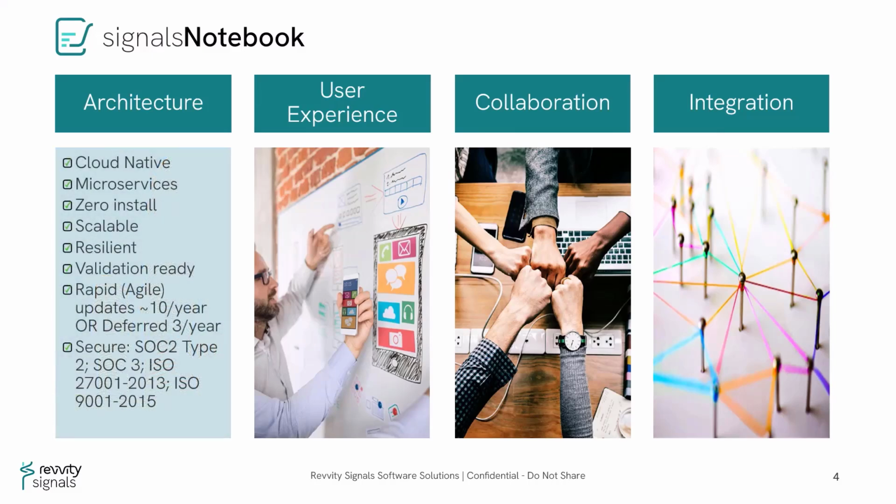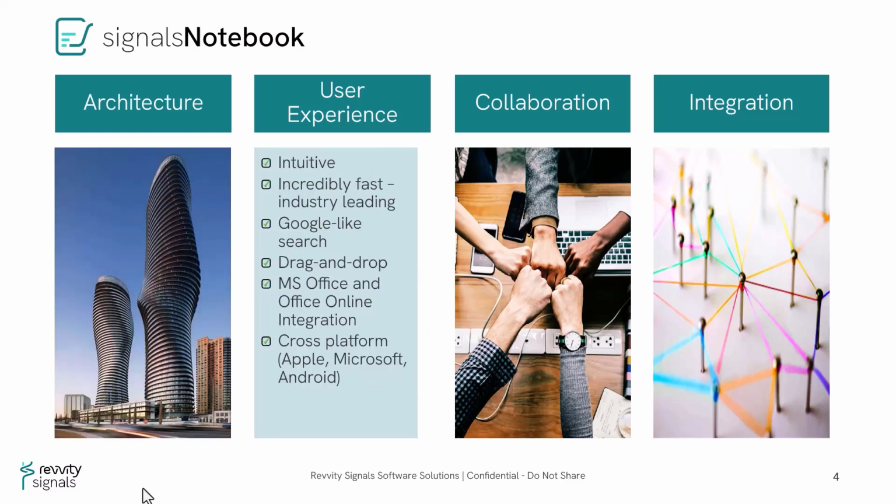Signals is a 100% cloud-based collaborative platform designed using the best available technologies so that your Signals Notebook is available anytime, anywhere, on multiple devices. This means you can access it using any web-capable device through any of the standard web browsers, Chrome being our recommended browser. Signals is built on modern microservices, which makes it extremely responsive, running parallel processes, providing fast, modern, and scalable performance.